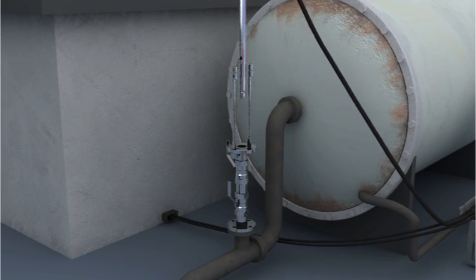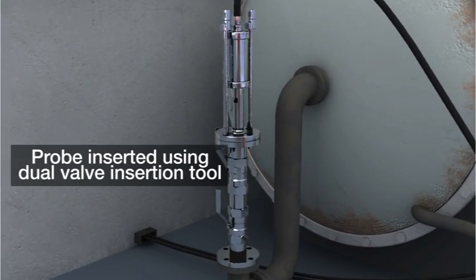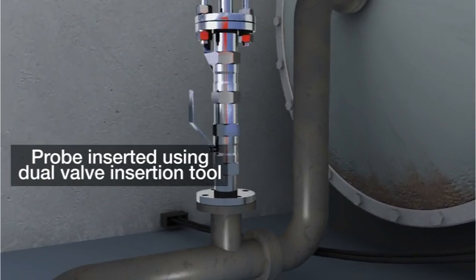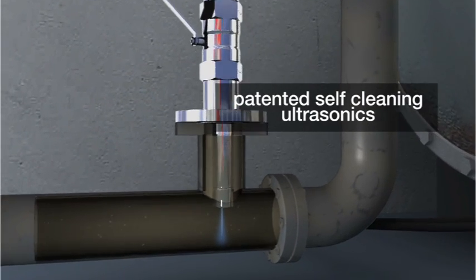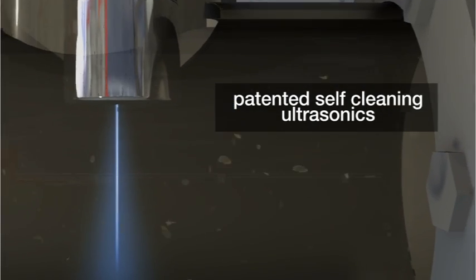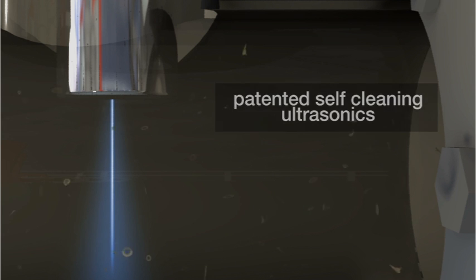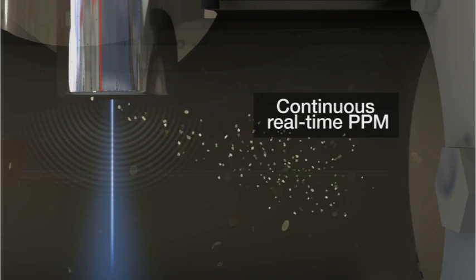The inline probe inserts easily into a process pipe, utilizing a dual-valve insertion tool. The probe utilizes Advanced Sensors' patented self-cleaning ultrasonics mechanism to ensure no operator intervention is required.